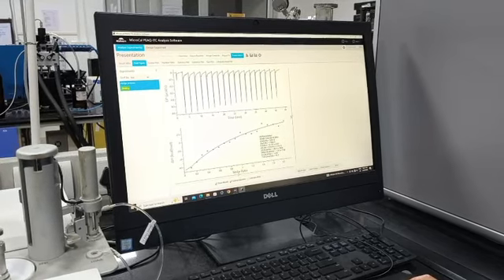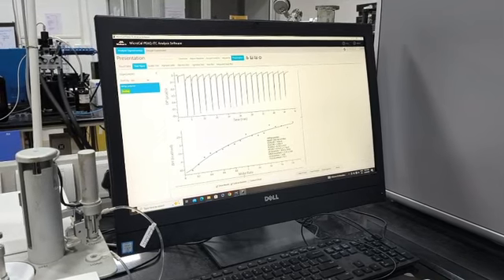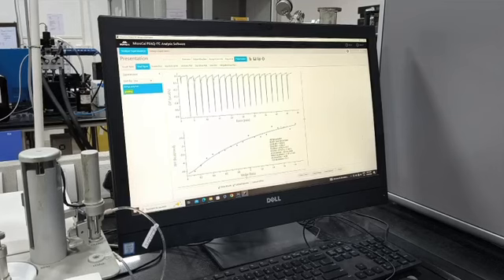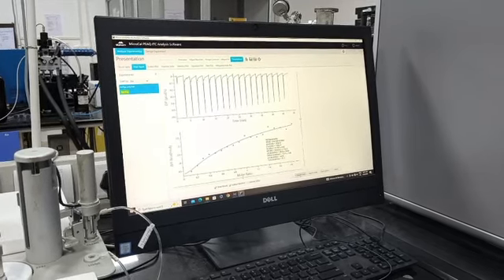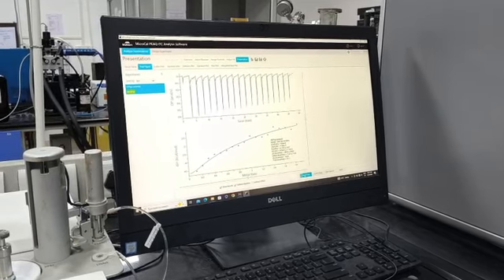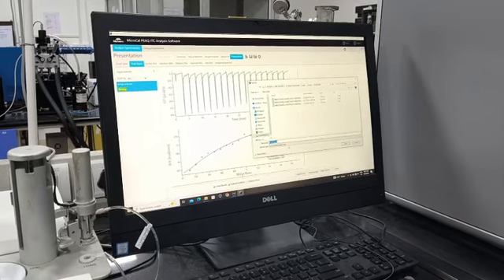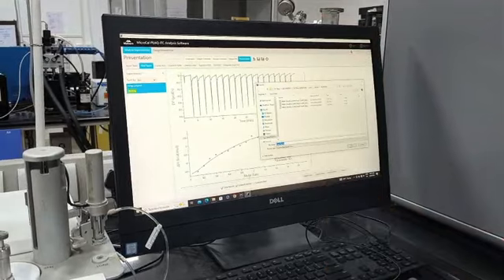So this is just a mechanical part, you don't need to bang your brain on this one. Now this result you can export in two ways. Export data, so it will export in .csv or text file. Let me see what was the file name of this one.